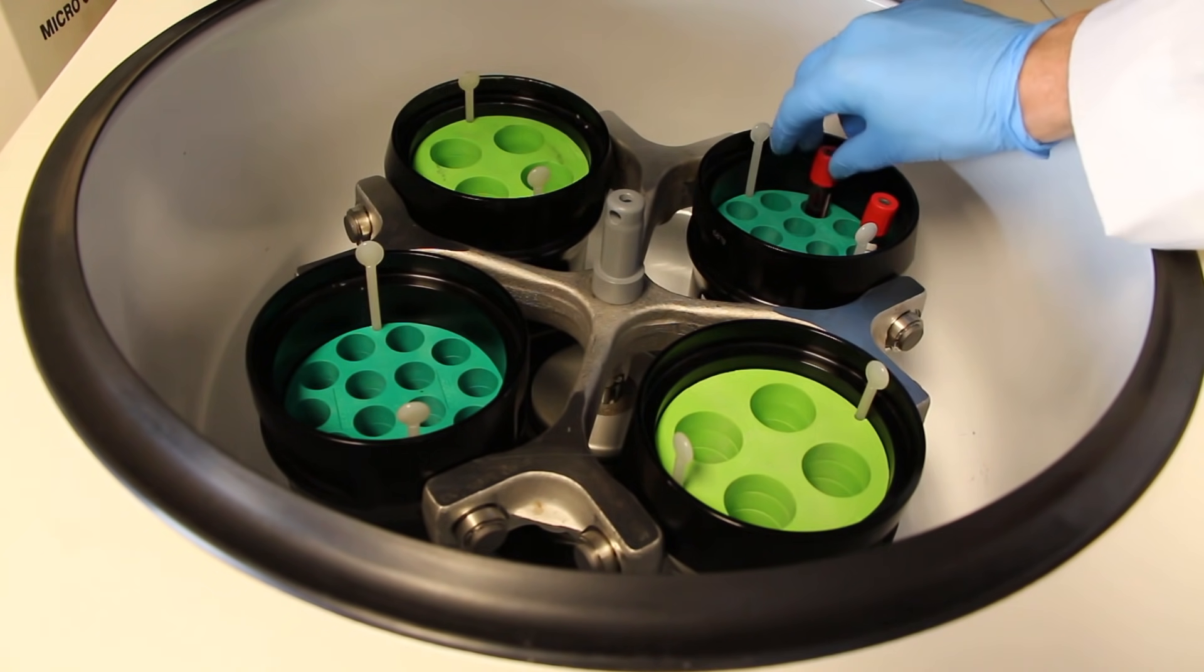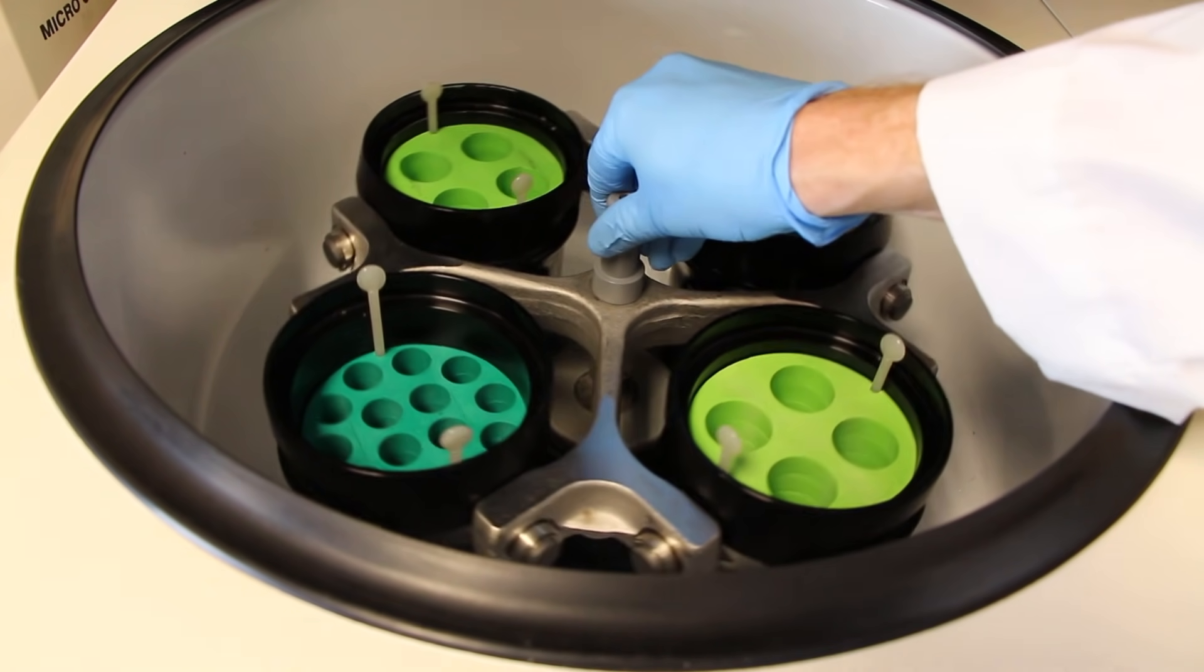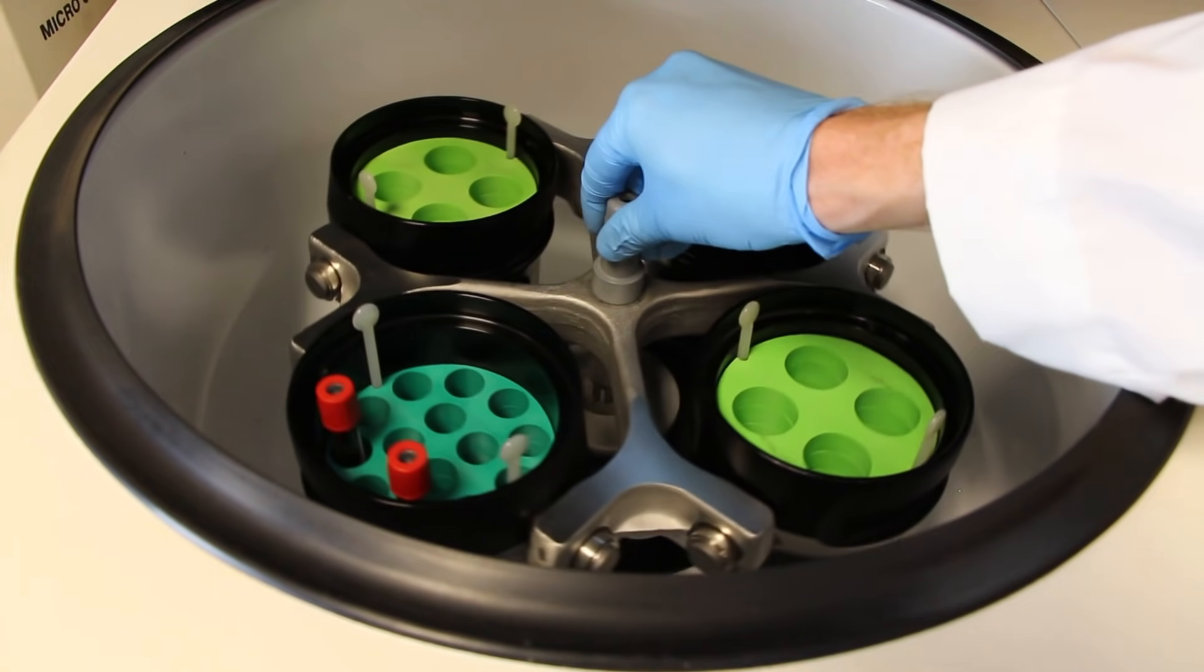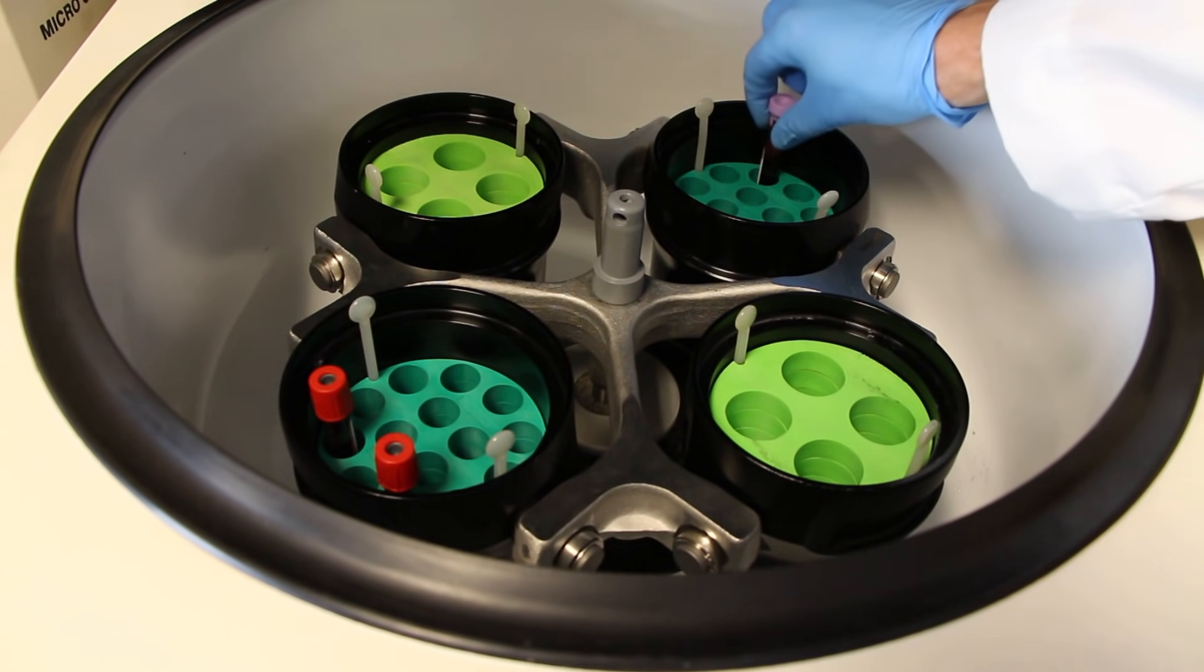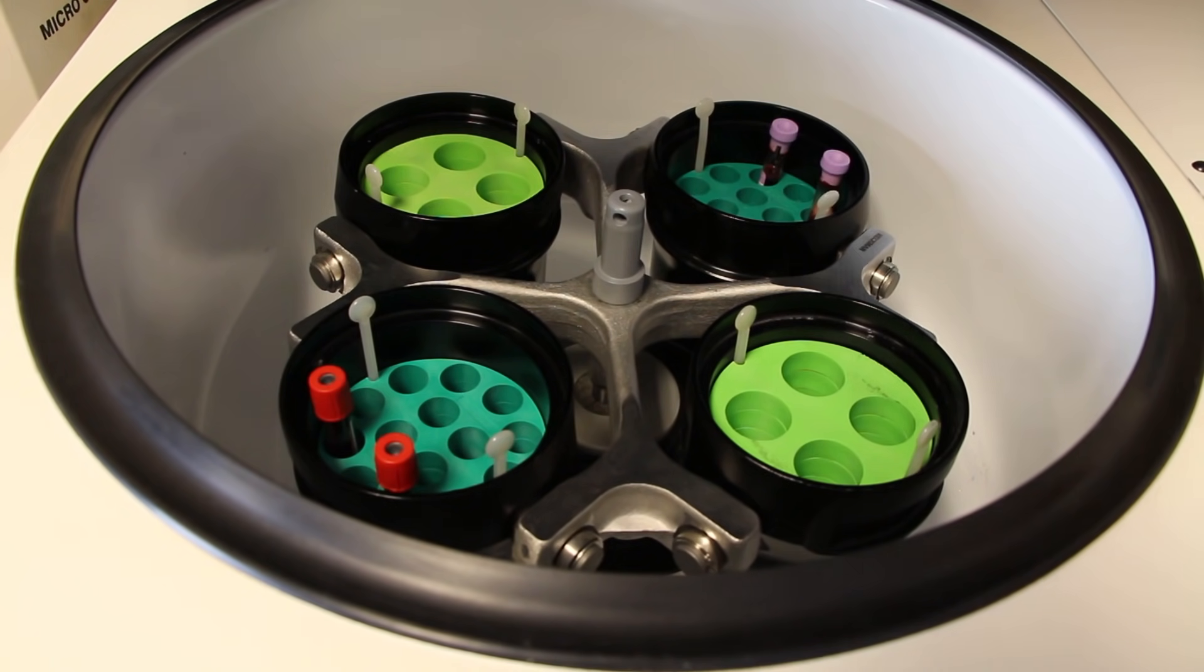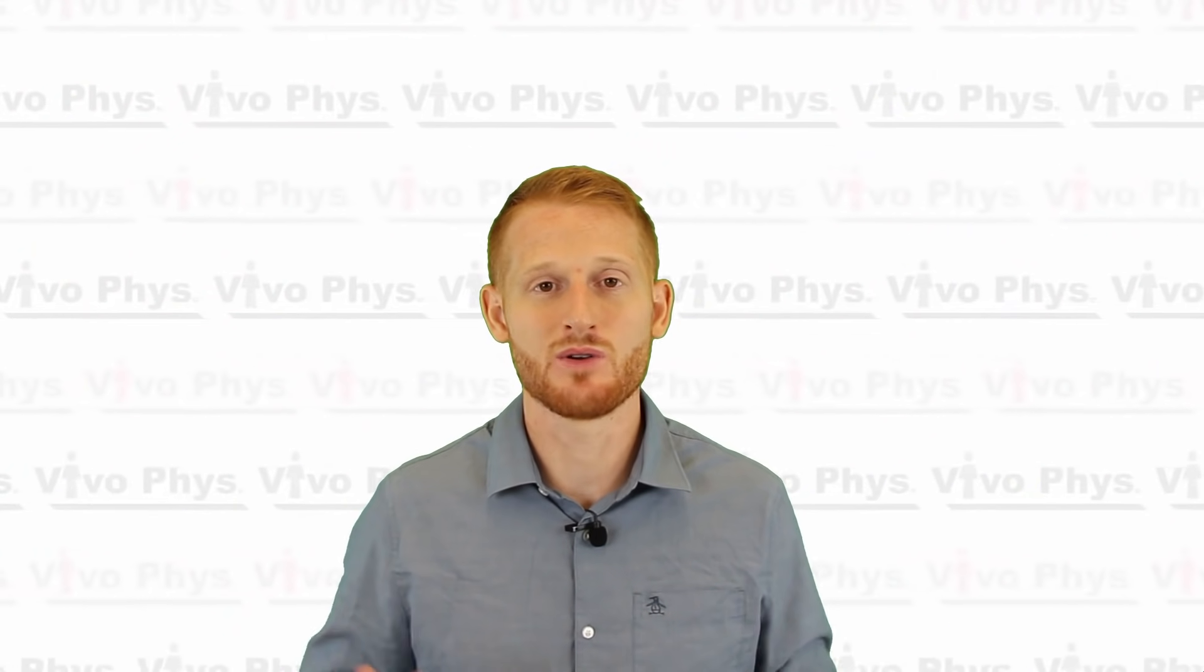The other thing you need to do when you're putting the tube inside the centrifuge is try to disperse them in such a way or to place them in there in such a way that they are balancing each other and their weights. So if you have one over here, have one over there, so that when it's spinning it's going to have the same amount of weight on both sides of the inside of that centrifuge and it's going to promote an even spinning.